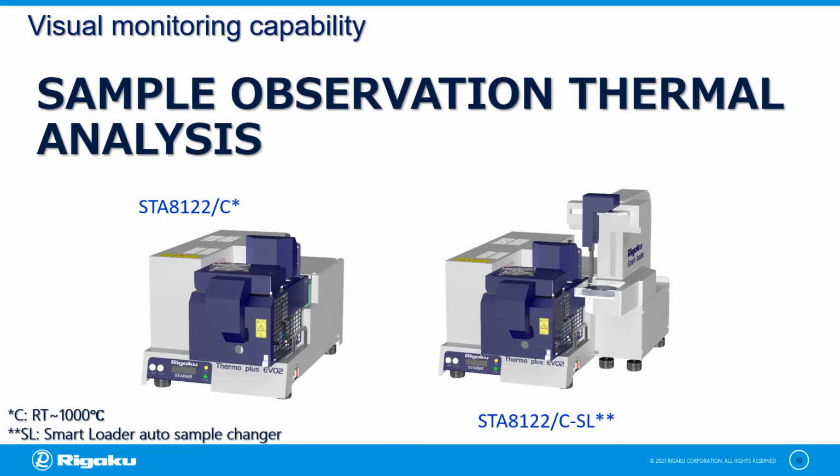Recently, the use of sample observation technology has become increasingly popular in the field of thermal analysis. Using this attachment, physical changes such as changes in color, shape, and volume can be confirmed visually, providing additional information and an accurate description of the obtained reactions.